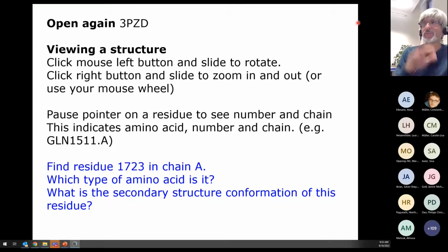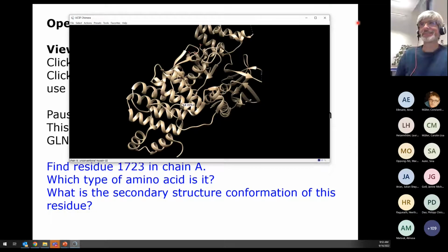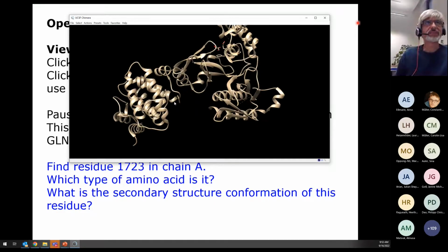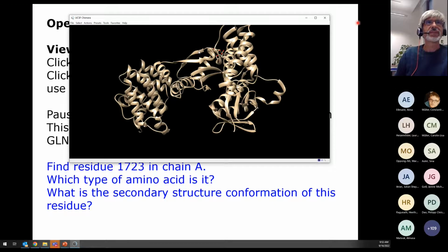Which type of secondary structure is it? Alpha helix? Yes, correct. So you see, I go here, 1570, in this direction. It's higher, so I can say, okay, more or less. I move around and then I'm here, 1692. I'm getting close.